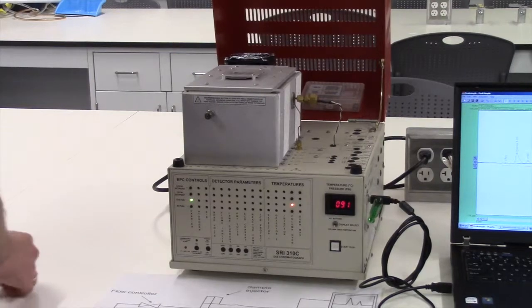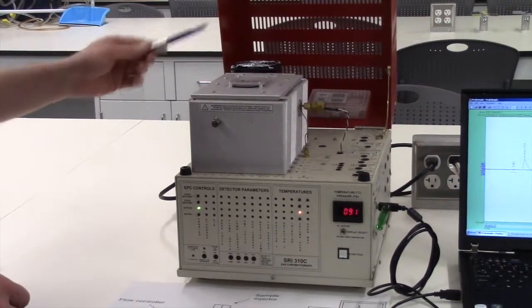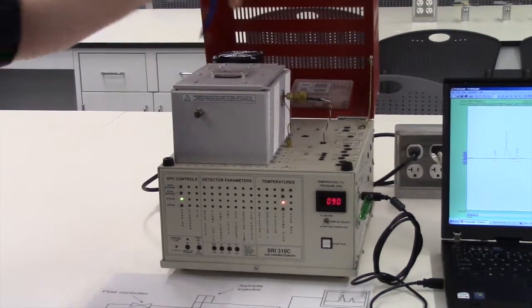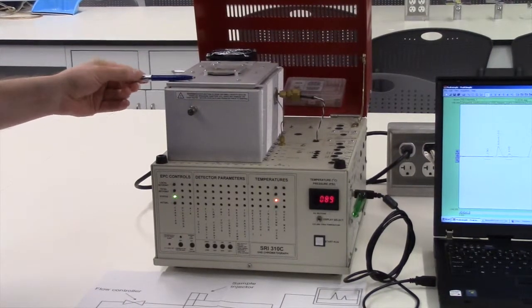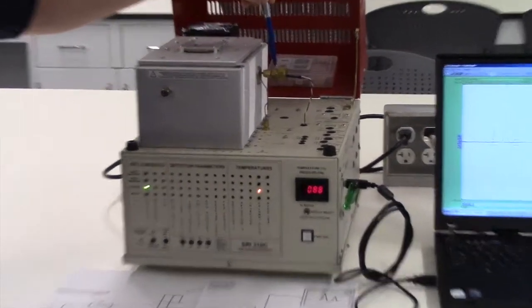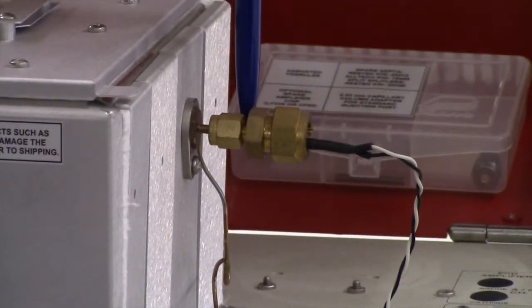So our sample is then separated in the column here, with a predefined flow and temperature settings, and once they reach the sensor, this CCD, catalytic combustion detector, they will be registered and recorded on the computer.